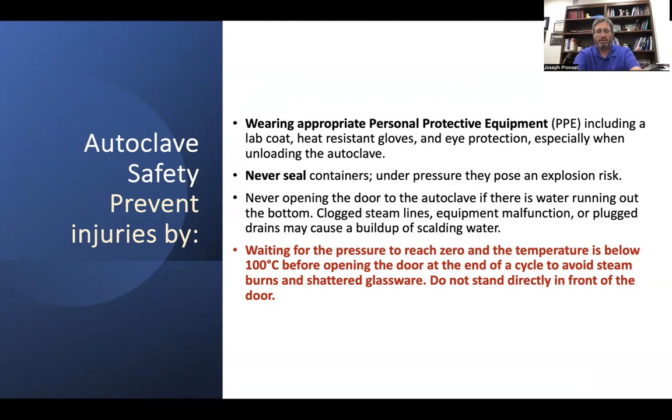And if you're dealing with liquids and they're not on a cart, you're picking them up individually, do not move them fast. If they're still really hot and we've got lots of gas and maybe still ready to come out, if you bump them or knock them, that can start all those gases to come out of solution. It'll basically boil over and then boil you.